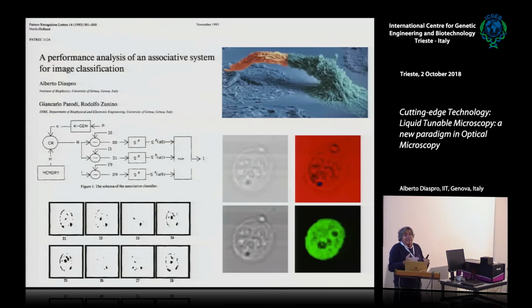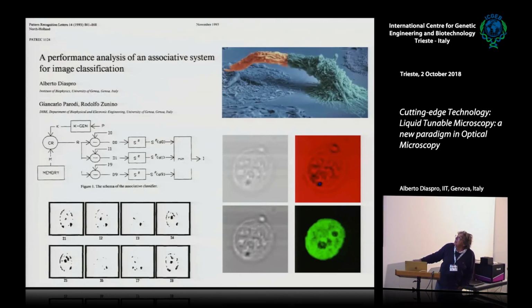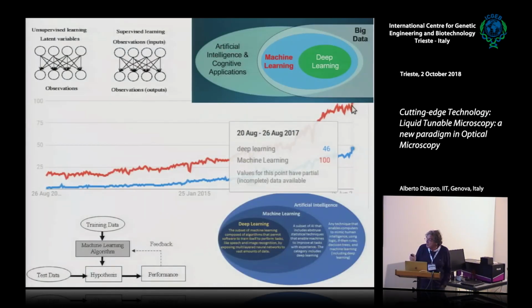Why do this? Because I think that we have been performing imaging in fluorescence since the 60s, and we don't understand anything of what's going on in so many things. Maybe we are biased, there is a mistake, and so a new approach maybe can open a new way of interpreting images. In this case, this is an associative memory approach that tries to insert some chaos in the image in order to find regions related to organization. Probably machine learning can help, on one side, machine learning, so all the part related to the knowledge and the way knowledge can be used, and then deep learning, which is a way of revising parameters for taking a decision based on the processing that is going on. That is what I need. I don't want something biased since the beginning.